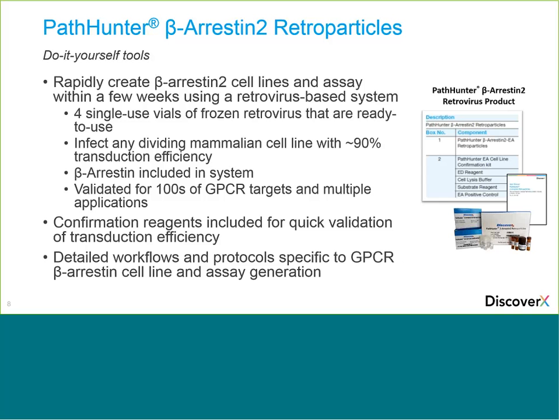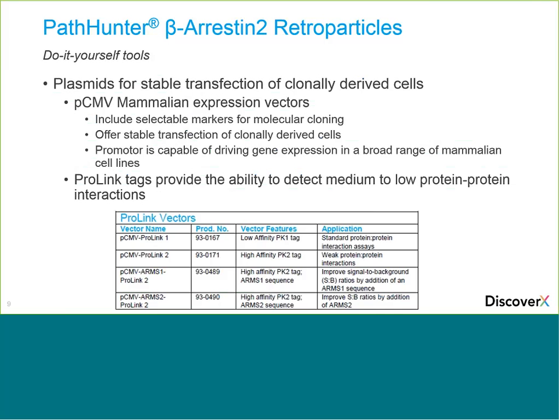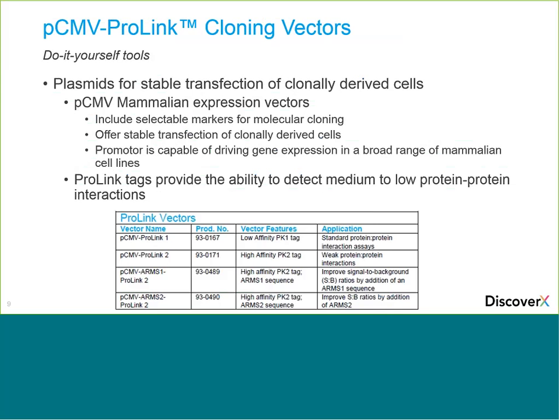In general, I wanted to introduce you to two terms, the difference between a cell pool and a cell line, because you see both of them in this picture. There are advantages and disadvantages for both. The advantage for a cell pool is it's very fast. You can get results within a week or so, and use this for qualitative assessment to confirm the intermediate steps in the workflow. It's not desirable, though, for screening or quantitative studies, and this is because this is a heterogeneous mix of cells. It's potentially unstable and may vary over time.